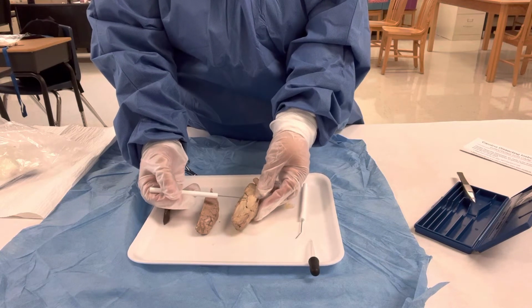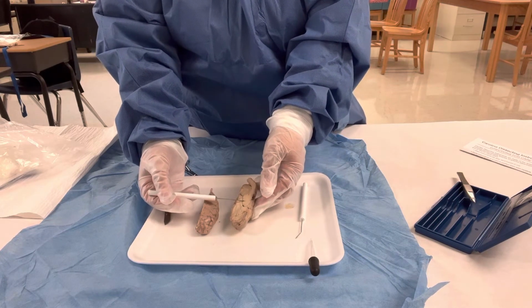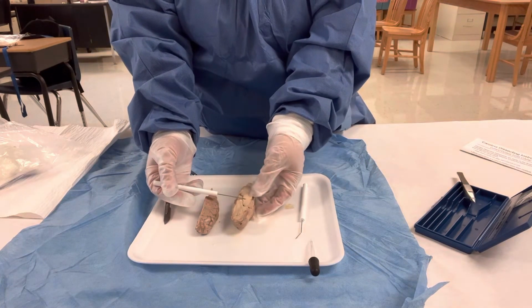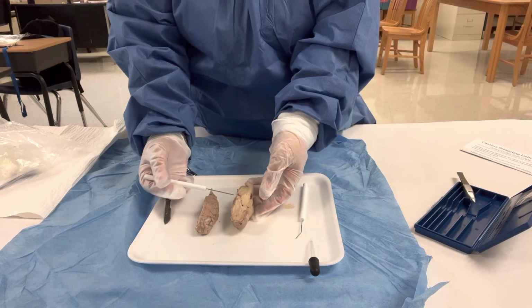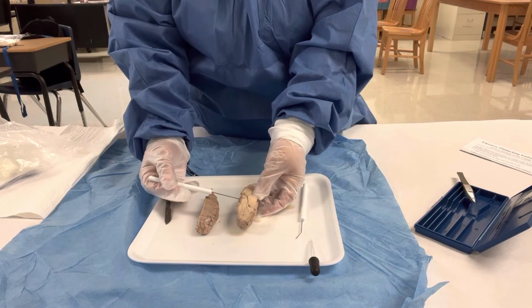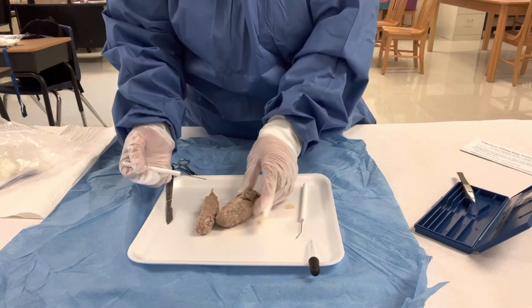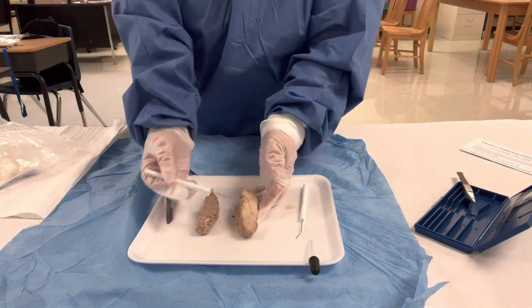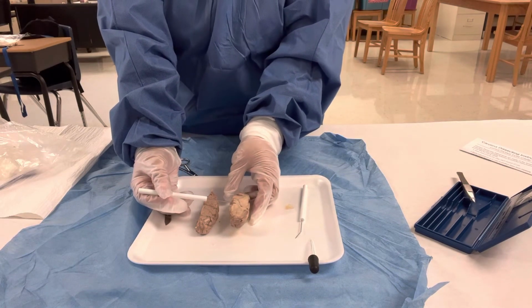The thalamus is the relay station for sensory information, receives messages from the nerve axons, and then transmits them to the appropriate part of the brain. You have the hypothalamus. This looks weird, right? The hypothalamus is responsible for regulation and maintenance of internal homeostasis by controlling body temperature, appetite, and fluid balance.